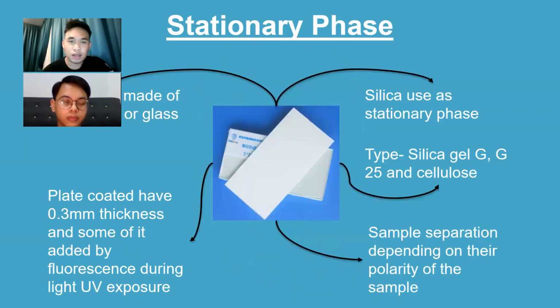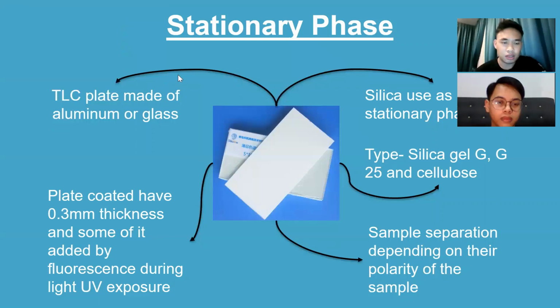So the next slide is the stationary phase. In the stationary phase, the TLC plate is made of aluminum or glass.